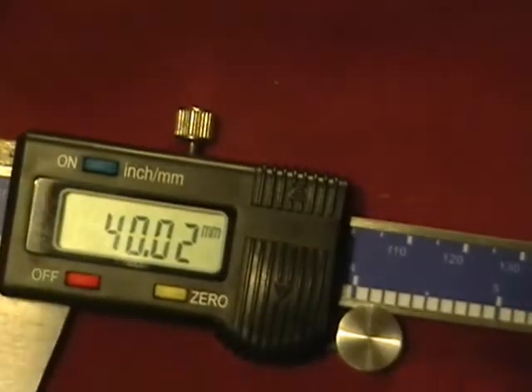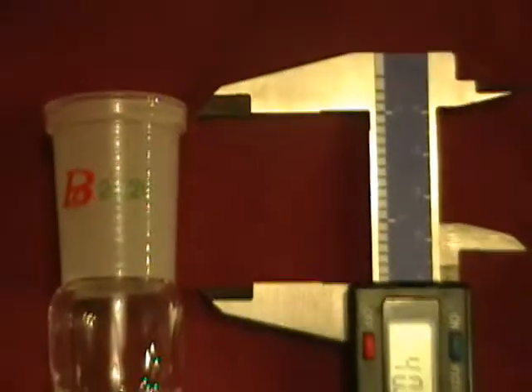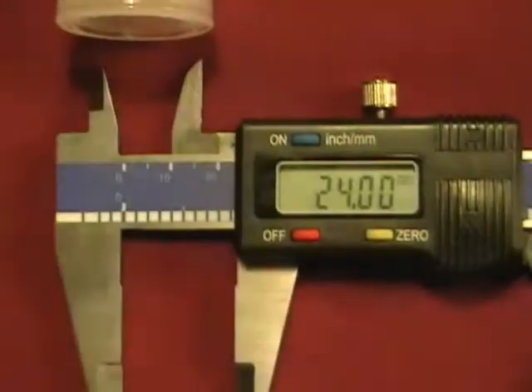These are mislabeled as 24/29. I used this digital caliper to show you it is just a misprint, and it is indeed a 24/40 ground glass joint.